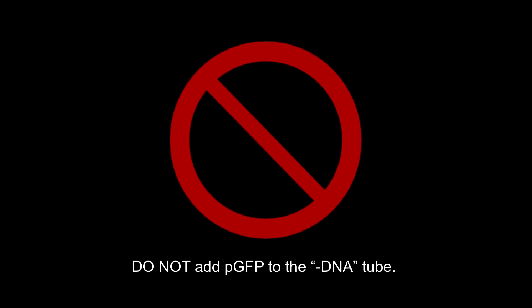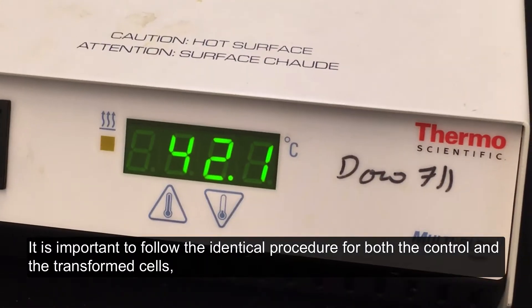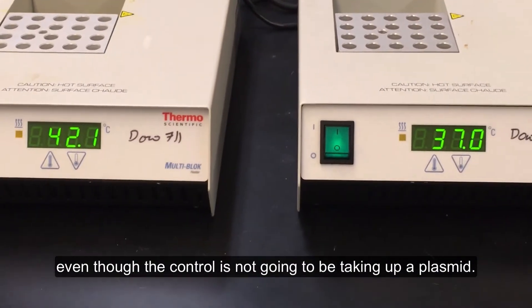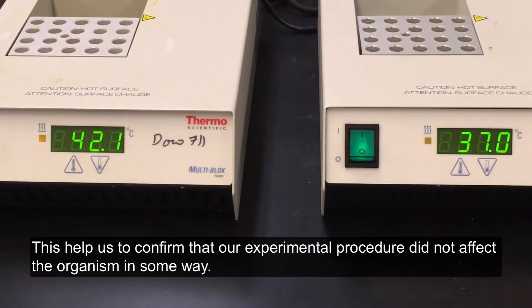Do not add PGFP to the minus DNA tube. Next we will heat shock the cells. It is important to follow the identical procedure for both the control and the transformed cells, even though the control is not going to be taking up a plasmid. This helps us to confirm that our experimental procedure did not affect the organism in some way.